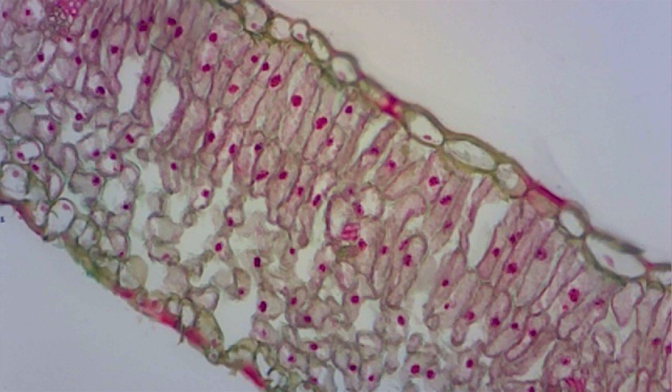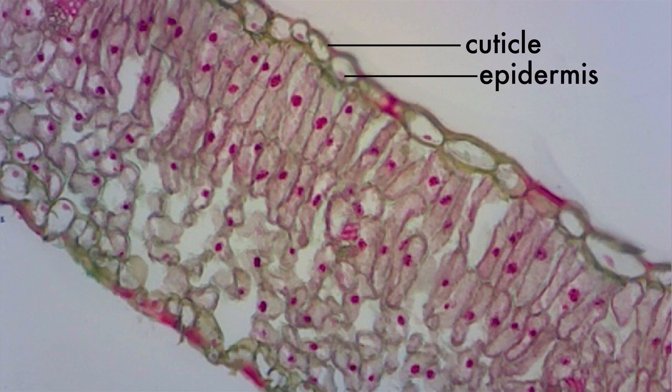Here's a cross-section of a leaf on high power. At the top is a thin, waxy cuticle, which is a protective layer. The layer of cells beneath the cuticle is called the epidermis, and it's also on the bottom layer of the leaf.